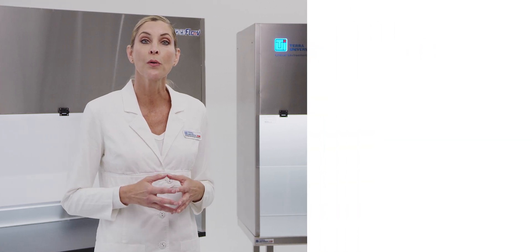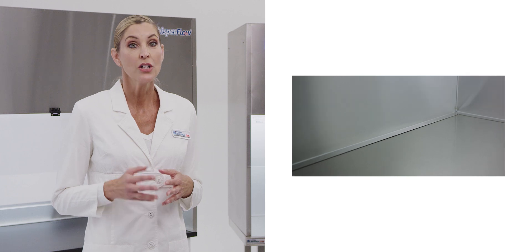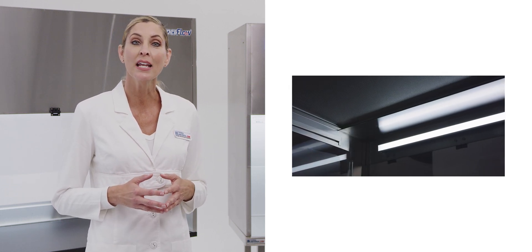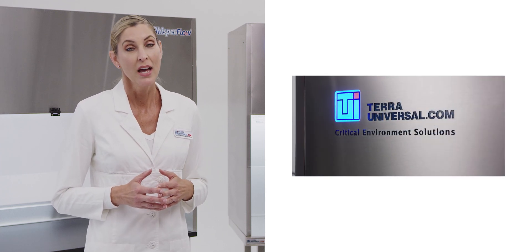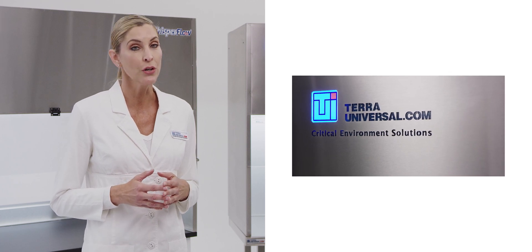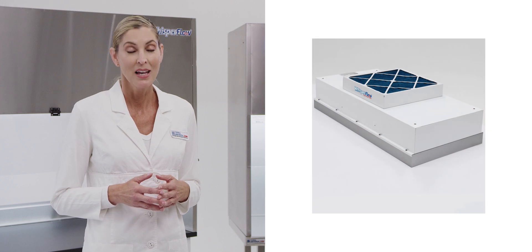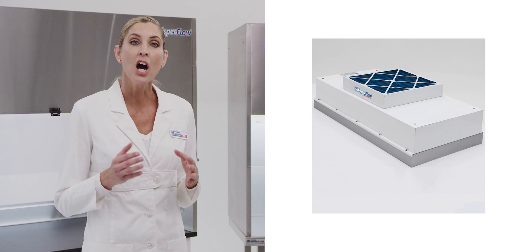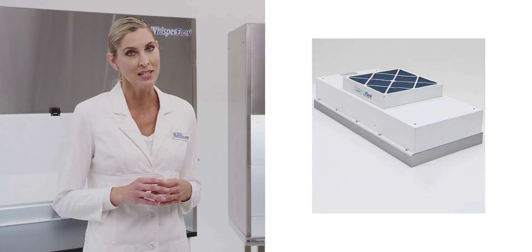The 304 grade stainless steel frame is seam welded to eliminate gaps or crevices to support easy cleaning. Recessed long-lasting LED lighting is installed behind the front shield to illuminate the entire work area. Tara's operation status indicator light alerts the user if the hood is turned off, preventing accidental sample exposure. Each Tara hood is equipped with a WhisperFlow HEPA fan filter unit that operates at a quiet 52 decibels to alleviate distracting background noise.